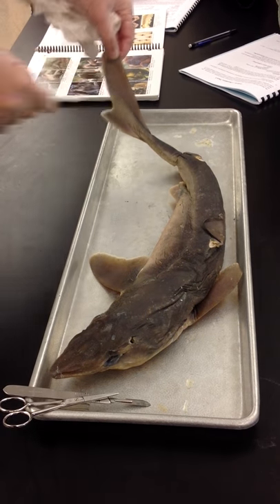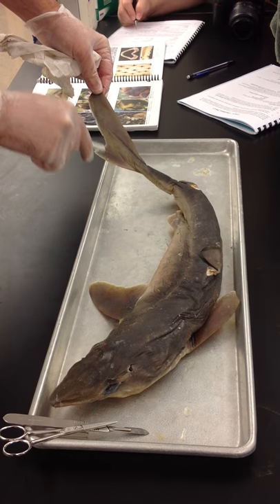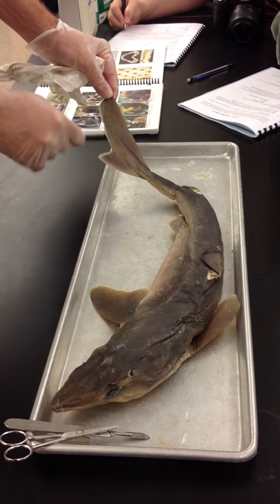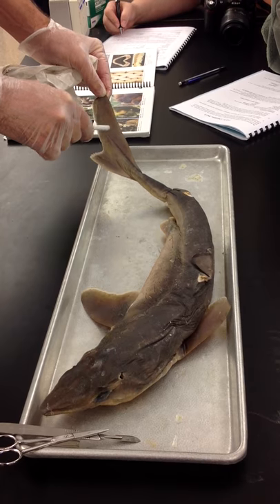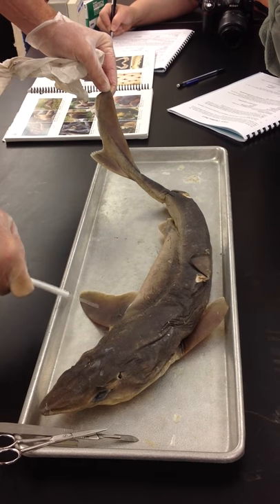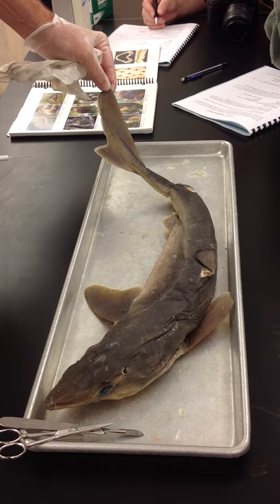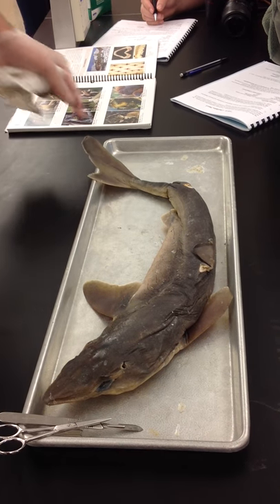The caudal fin is the tail fin, and it's a two-part caudal fin. You can see it's asymmetrical, and that's so when they swing the tail back and forth very heavily, it gives more force on the upper side than on the lower side. It has a tendency to drive the nose down, so they then use their pectoral fins to counterbalance that and maintain their position in the water. But the caudal fin is basically the tail fin.